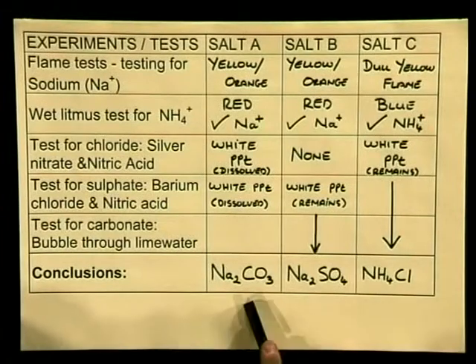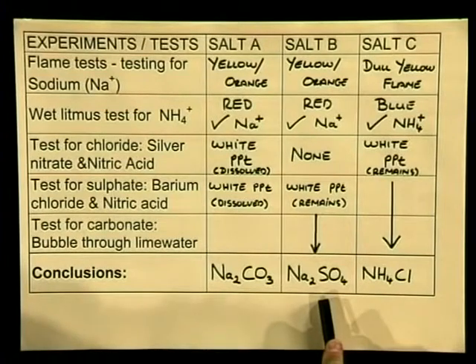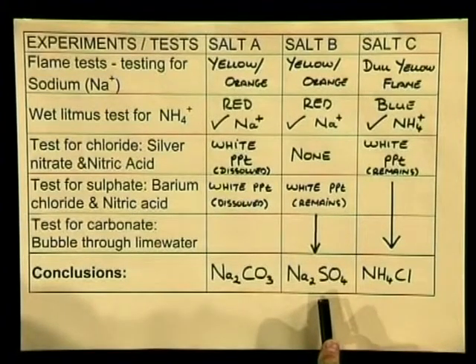Let's note our final conclusions. Test tube A contains sodium carbonate while test tube B contains sodium sulfate. The mystery of the unidentified floating objects is solved. However, I would like to perform one more test to confirm that test tube A did indeed contain sodium carbonate. What I would like to show you is what happens when I add acid and the gas that is formed is bubbled through lime water.